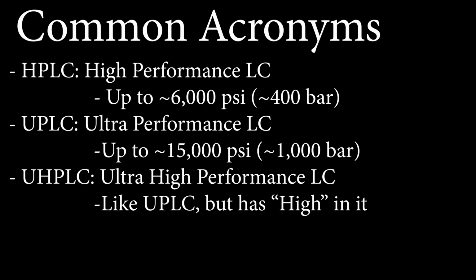The distinction between UPLC and UHPLC is something hardcore chromatographers will debate and discuss, but a lot of that has to do with marketing. But the basic concept, LC, HPLC, UPLC, it's all the same. You also hear people say, oh no, I have a flash chromatography system, FPLC. It's still liquid chromatography. It's all the same principles when you get down to it.